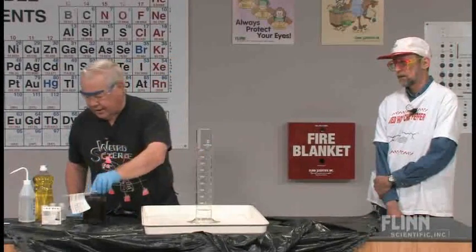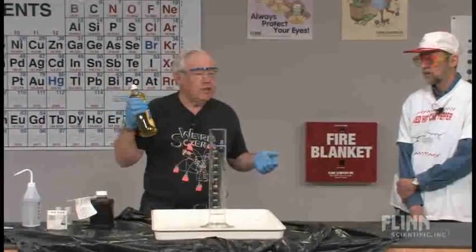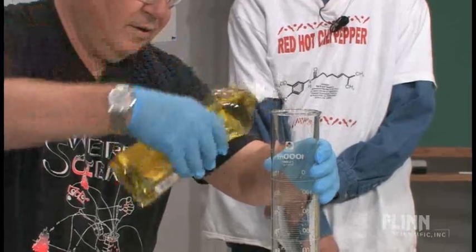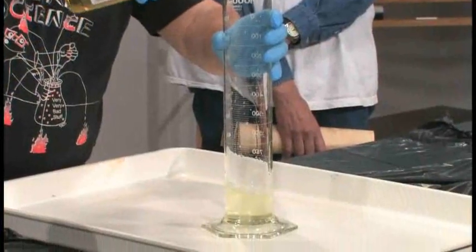We end up needing to put some joy in your teaching, and so I have some Joy detergent, so I'm going to put some joy in. Always a little joy in your classroom. So here we are.